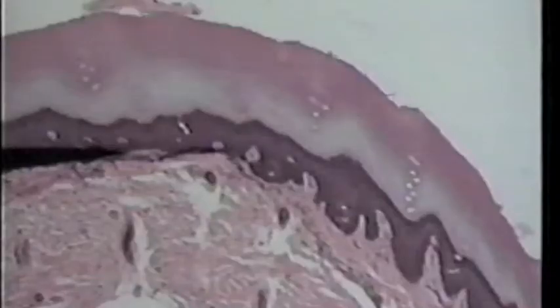Now we'll view these same layers on high power. Here on high power, if you look closely, you can see the tip of the pointer right between the epithelial layer and the connective tissue layer of the skin. But those two layers, epithelium and connective tissue, are really the epidermis above the pointer and the dermis of the skin. We'll focus first on the epidermis of the skin.